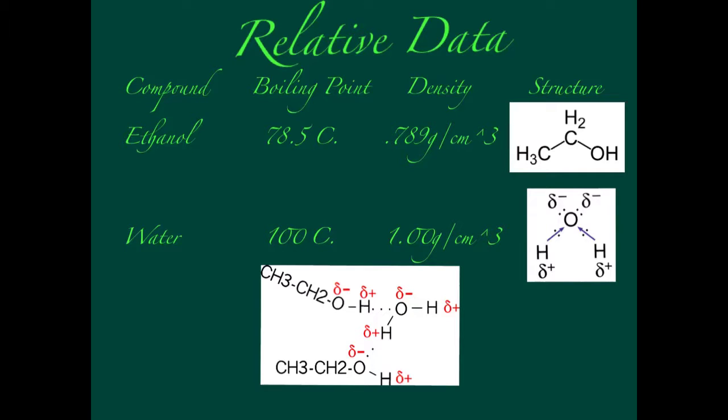So, in today's discussion, we will include the distillation of ethanol in our experiment, which has the properties that we want to take note of. Its boiling point is at 78.5 degrees Celsius, and we should take note that in its structure, it has a hydroxyl group.